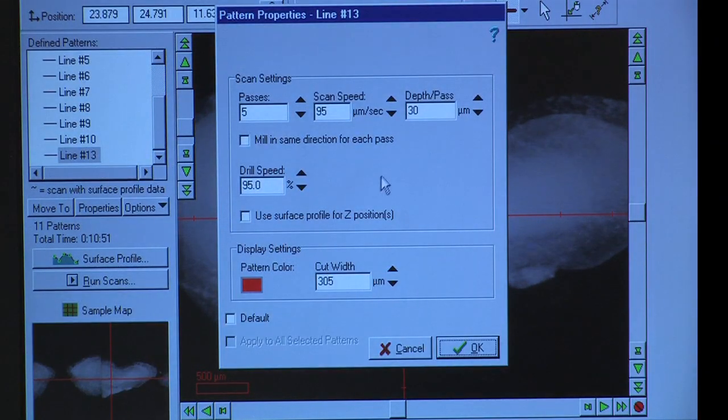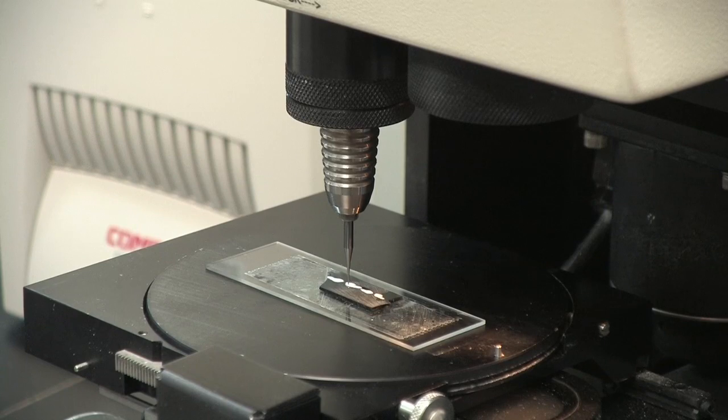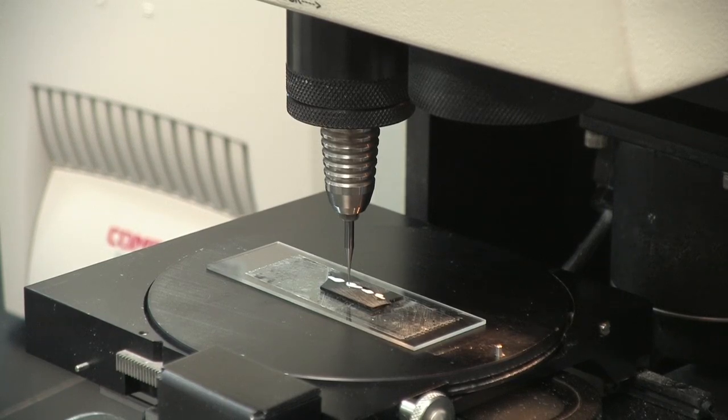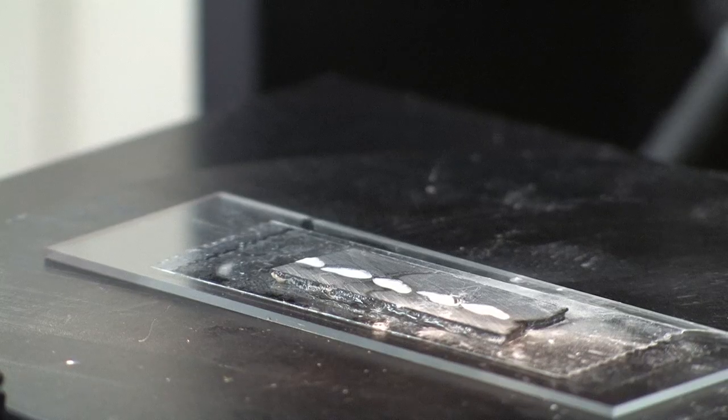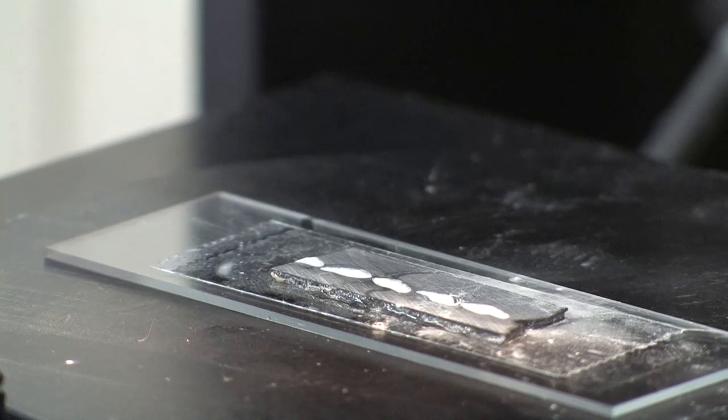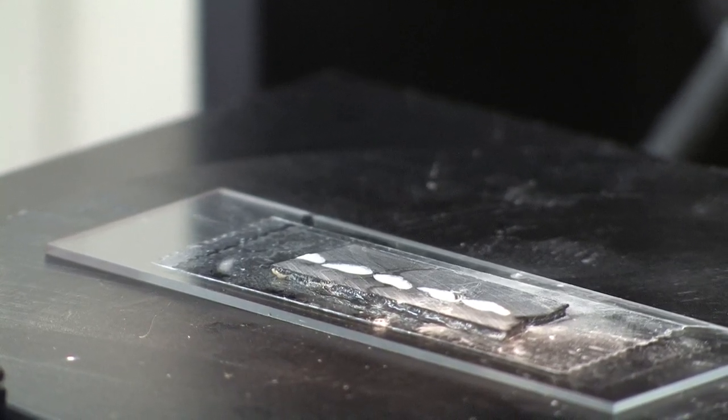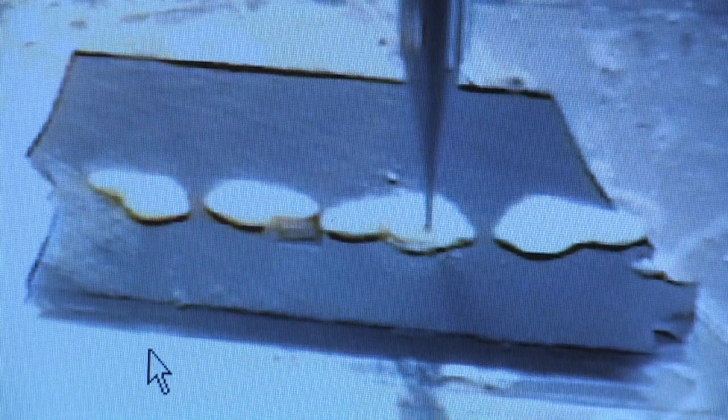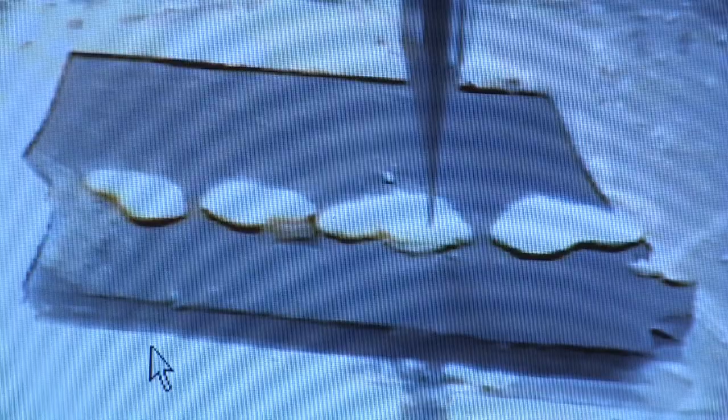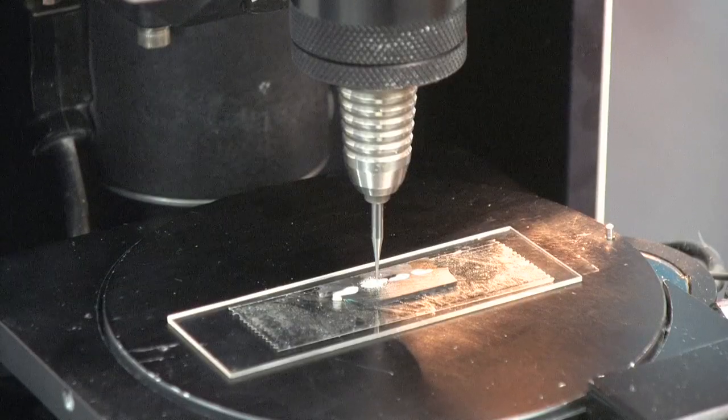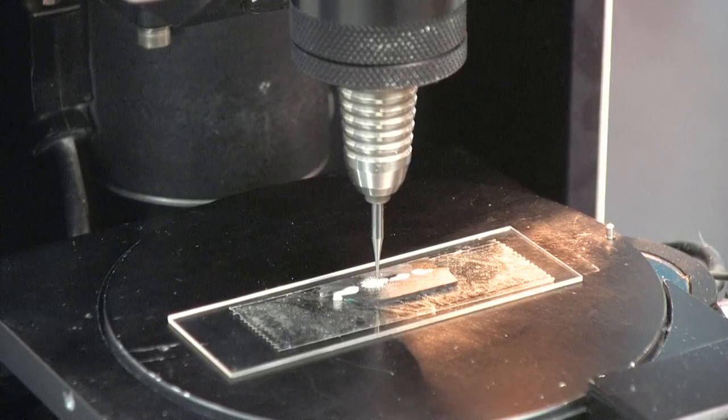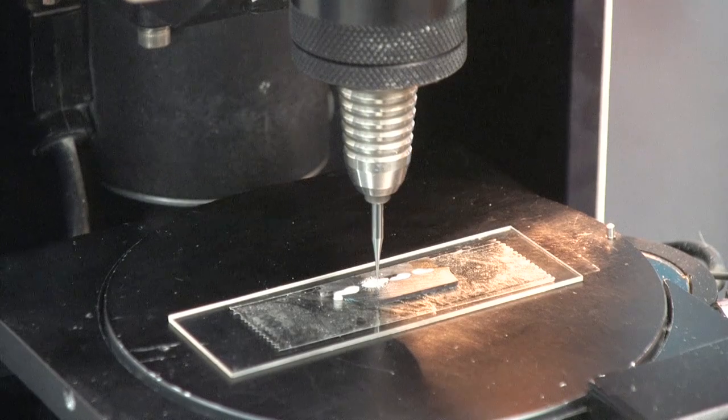It will be necessary to determine how fast and deep you want the drill to cut through the otolith. These settings will vary with the otolith sample as some are larger or smaller, hard or more brittle. It helps to have samples embedded in epoxy or resin. You don't want to drill too deep or have a scan speed too fast or you will crack and damage your sample. The core will probably break, but you want to try to minimize this as much as possible. The settings are as follows.